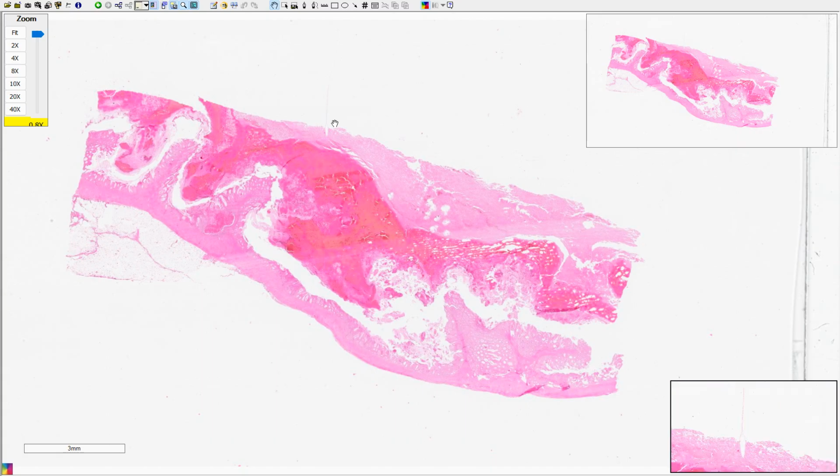So in front of you now is the slide for coccidiosis in chicken. The tissue of the slide came from the cecum of chicken. From here you can see this is the intestinal mucosa, and this part here is the area that we call cecal core.